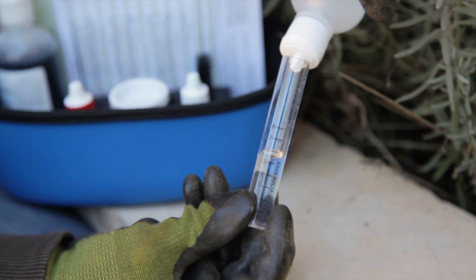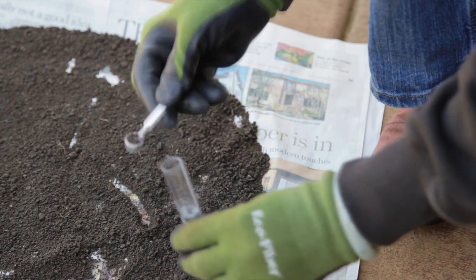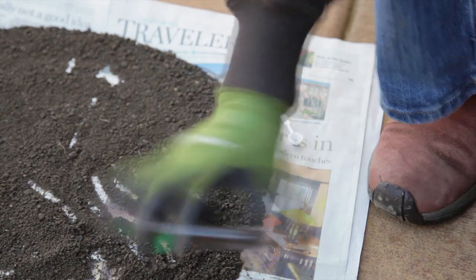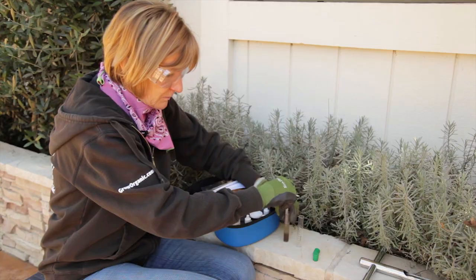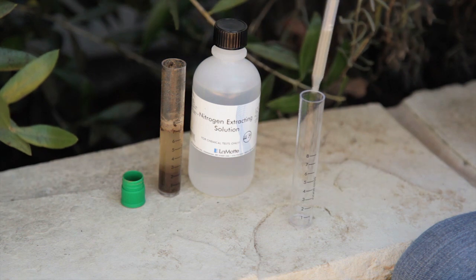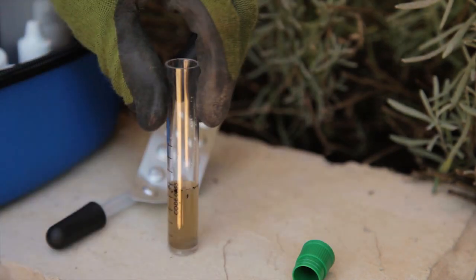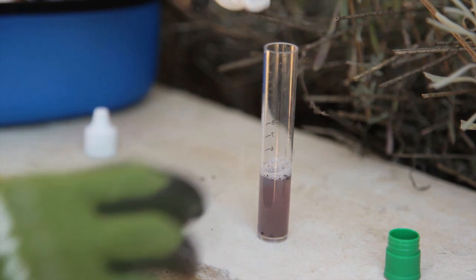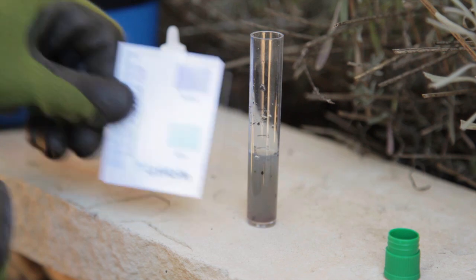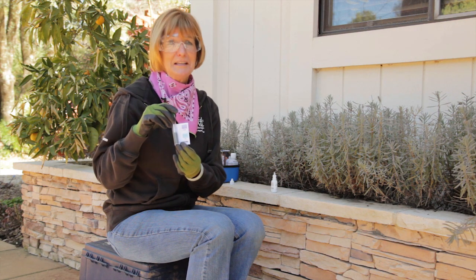The last nutrient I'm going to test is the potassium. Fill a clean test tube to line 7 with the potassium extracting solution. For the potassium, we're going to add four scoops and then shake vigorously, not gently. Allow it to settle and move it to a clean test tube with a pipette. It needs to be filled to line 5, so you might have to prepare more soil. Add a potassium indicator tablet and mix gently until the tablet dissolves and the liquid turns purple. Add the potassium solution one drop at a time. Mix in between the drops and keep track of how many you put in. Stop adding drops when the liquid turns from purple to blue. I had to add 25 drops to get the potassium color light blue. I'm really low on potassium.